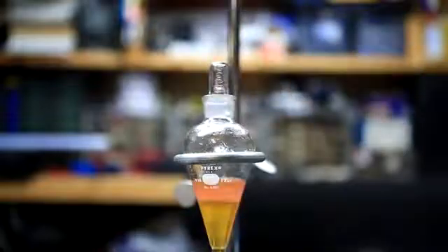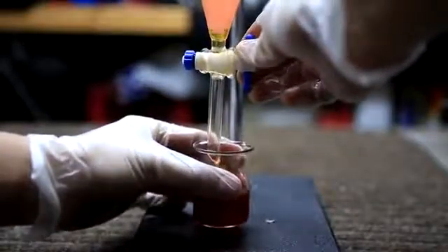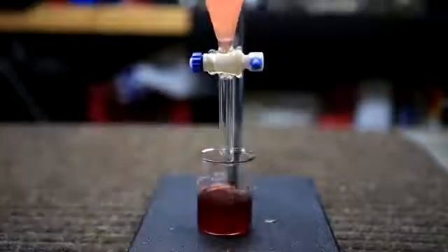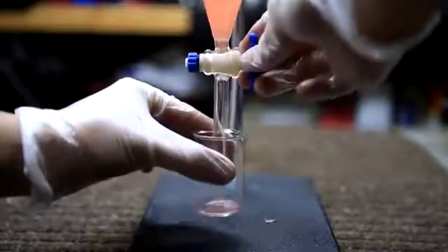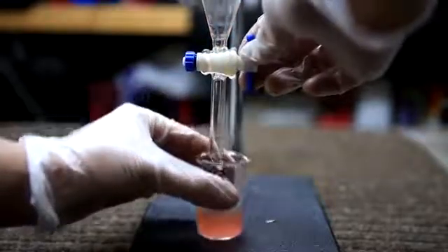This time, the lower DCM layer is yellow and not a dark red, indicating that there is much less phenolphthalein present. The lower DCM layer is combined with the previously drained DCM. The aqueous layer, which contains mostly unreacted phenol and sulfuric acid, is disposed of.